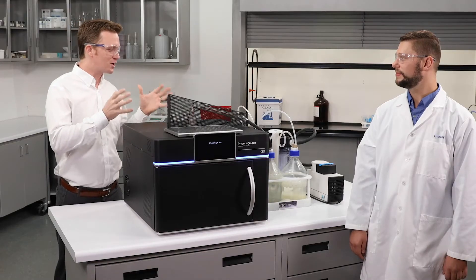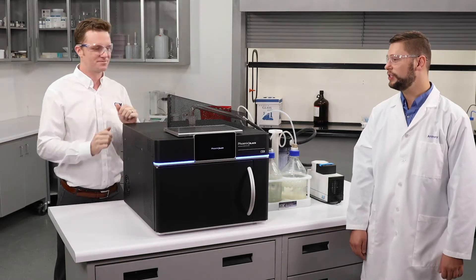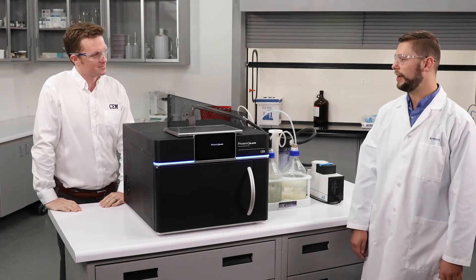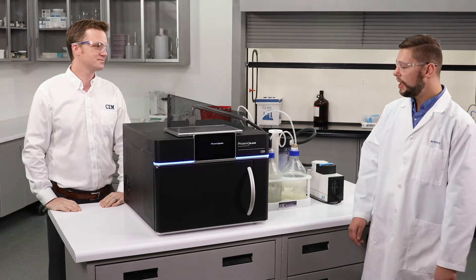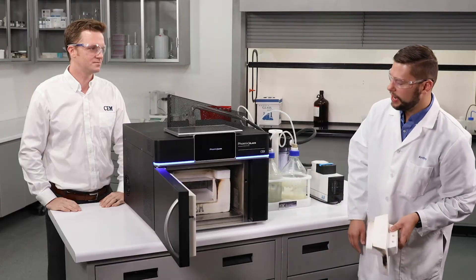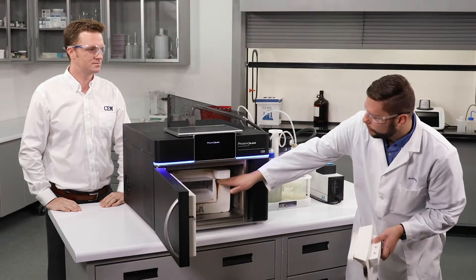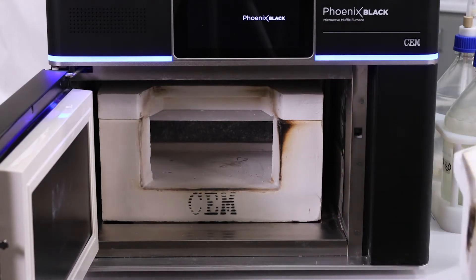There is something unique going on inside the unit. Typically when you're running samples for sulfated ash you're going to use that ash for some sort of further analysis. You really want to make sure that you're not getting any contamination into your sample, so there's a quartz plate that sits at the top of the furnace to prevent anything from falling into your sample, and it's very easy to clean.